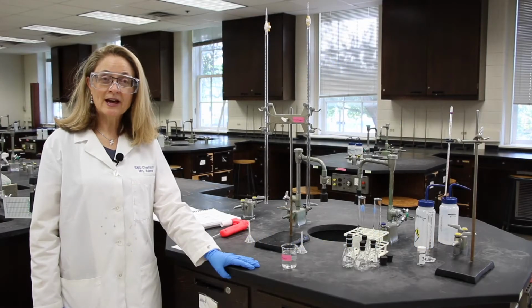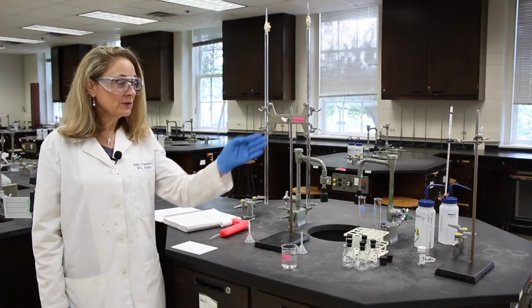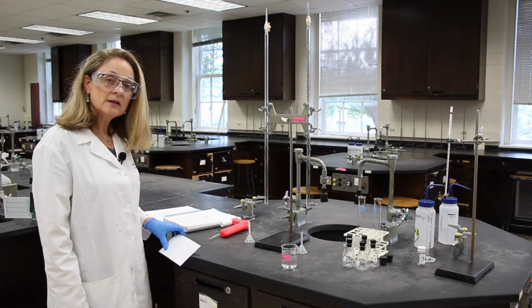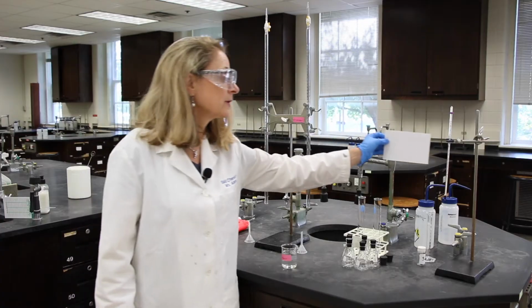Hello, welcome to lab. Today we're going to do experiment 1, density of liquids and solids. The first thing we're going to do is read the temperature. Density varies with temperature, so it's always important to record a good temperature before you start your experiment.